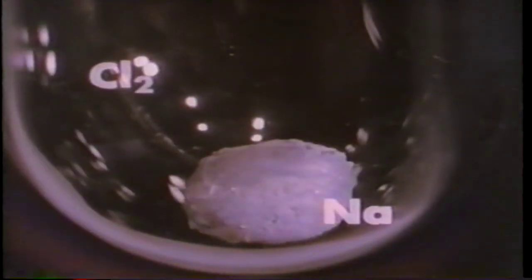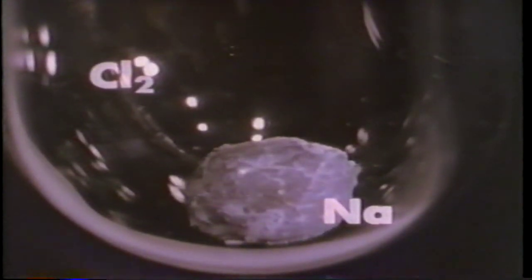When the lithium melts, there is a reaction with the chlorine, producing solid lithium chloride. Sodium melts. The crust cracks. And the liquid sodium reacts vigorously, producing solid sodium chloride.